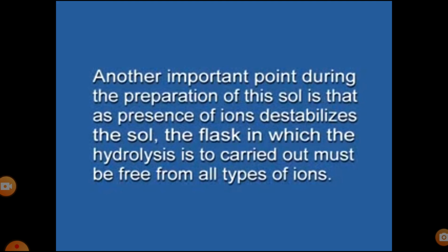Another important point during the preparation of this sol is that the presence of ions destabilizes the sol. The flask in which the hydrolysis is to be carried out must be free from all types of ions.